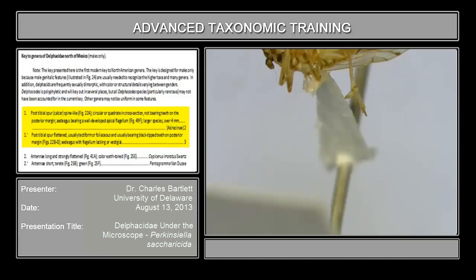The calcare is spine-like, circular or quadrate in cross-section, not bearing teeth on the hind margin, as opposed to post-tibial spur flattened, usually tectiform — which is tent-like — or foliaceous — which is leaf-like — usually bearing black-tipped teeth on the posterior margin.